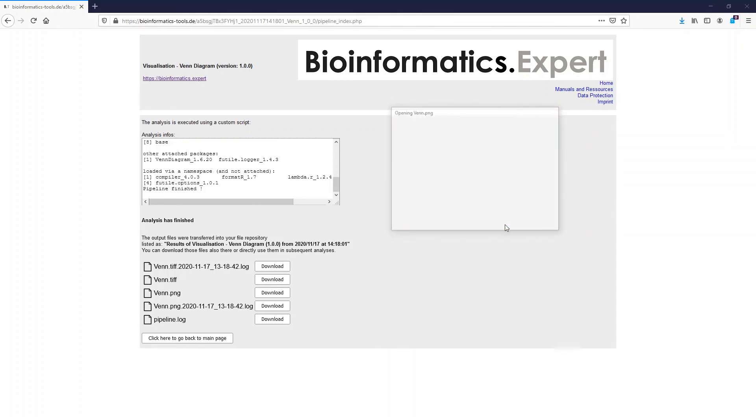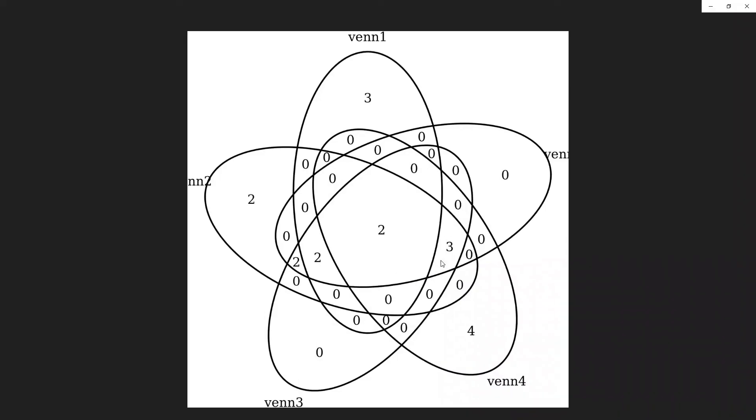The output of the analysis looks like that. You see that we have two overlapping elements in all five lists.